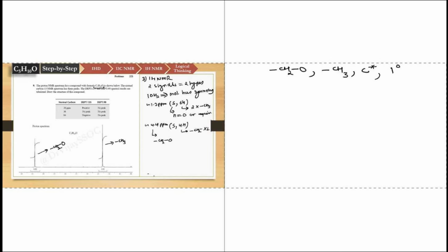Okay, so when I see the 1 degree of unsaturation, the first thing which comes into my mind is carbon double bond carbon of the alkene group. But when I write carbon double bond carbon, then I cannot satisfy the 1H NMR, because as you can see there will be CH2 and CH3, which is going to show the triplet and quadruplet, and there will be alkene protons as well. So this cannot be the correct structure at all.